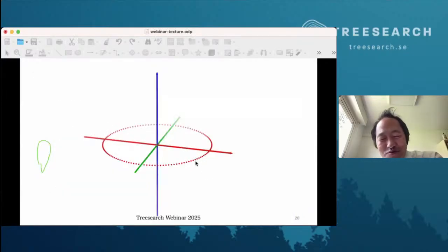So what I'm trying to explain is what happens when you have planar orientation, which is the following. I'm considering now a lot of points around the fiber axis. If you have a cellulose fiber that is rotating around the chain axis, the diffraction of, for example, the 200, something that is perpendicular to the fiber axis, is along the circle. If you have a random orientation and you have a lot of these in one direction, you will have this kind of situation.